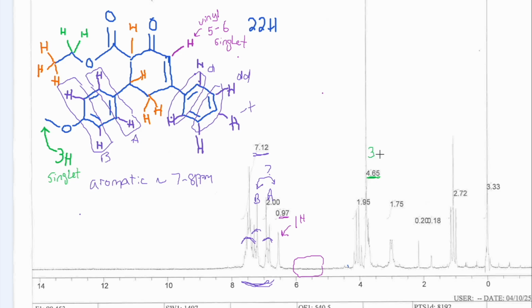So this is 3. I'll put the 2 in orange. So we have about 5 here. 4 of these orange ones that I've drawn, 2 over here and 2 underneath where this singlet is. That's why it's integrating for more like 5 when it should be 3. So the singlet is worth 3. You can tell there's something underneath the singlet that's not a singlet. We got some other signals under there, but the sharp singlet for 3 hydrogens is there.